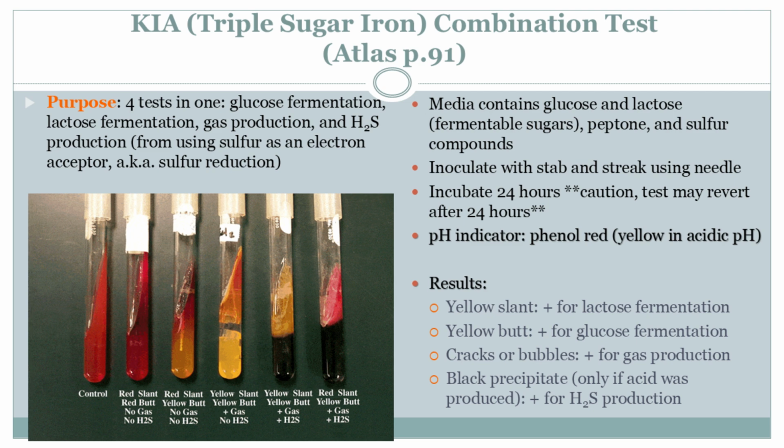And then we get to analyze the results, right? Like, what are we actually looking for after the incubation? What kind of visual cues give us the intel we need? Get ready for some pretty dramatic transformations. The agar itself becomes like a message board full of clues. And those color-changing pH indicators we talked about, they're the stars of the show. So we're looking for color-coded messages from our microscopic friends. What do the different colors tell us?